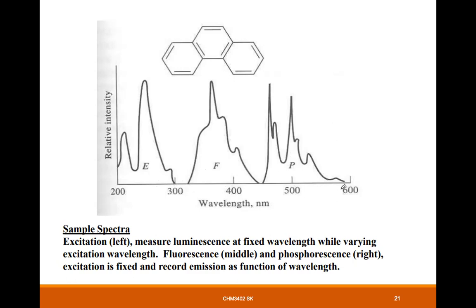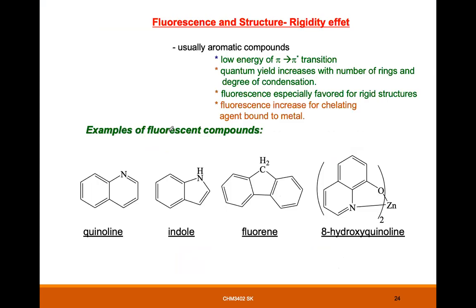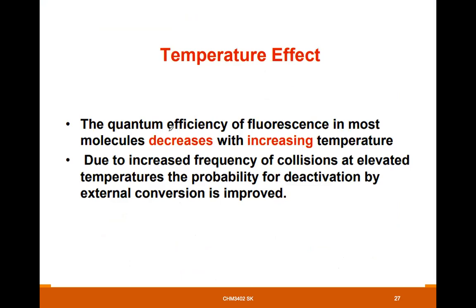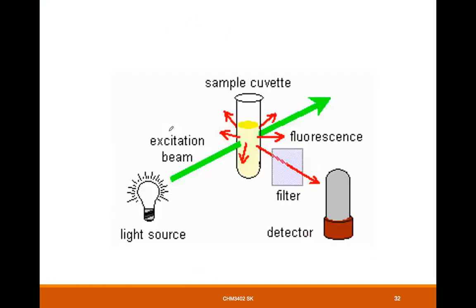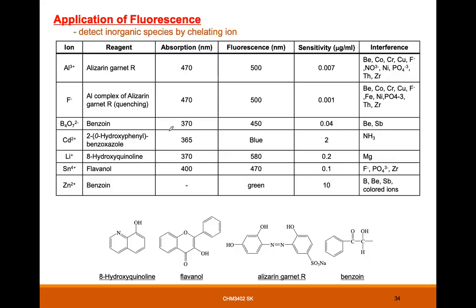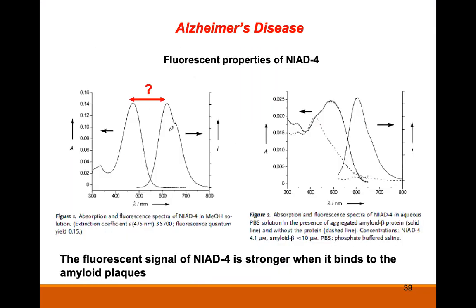Okay, in order to have this fluorescence spectrum, we need to do some analysis on the excitation wavelength. So let us move to the example straight away before we can understand. I think I have. Right.